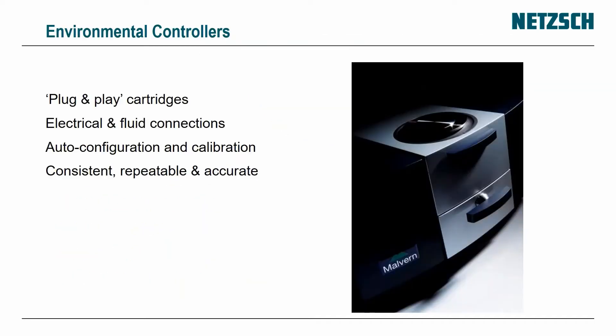Even the environmental controllers and temperature controllers are plug and play. When you put them in, it connects all of the electrical and fluid connections all in one go — this is auto-configuration. The calibration is stored inside each cartridge to give you a consistent, repeatable, and accurate result.